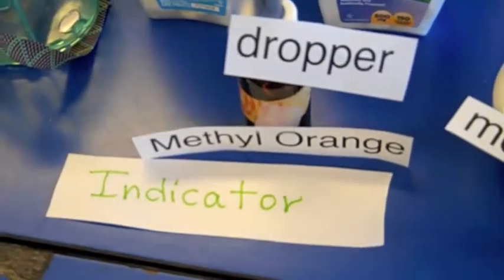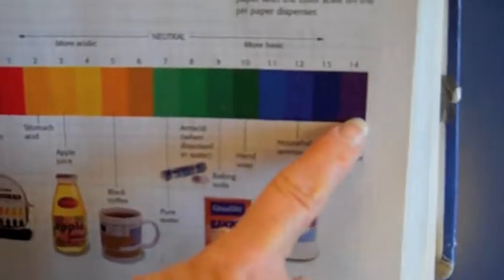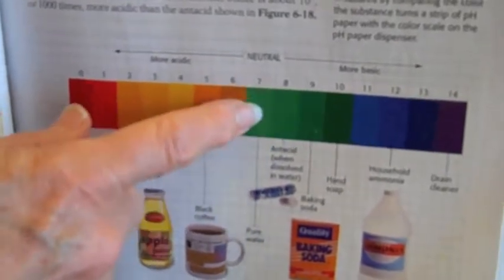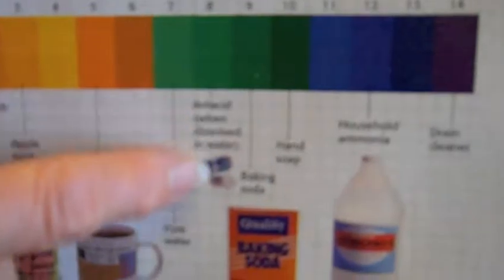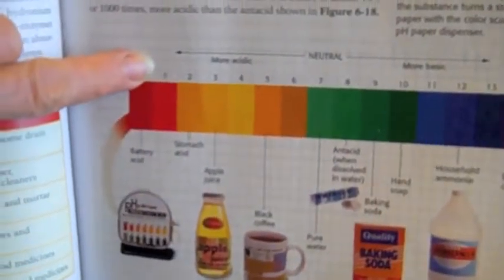So you know from your work already with the pH scale that one end of the pH scale, the lower end, is acidic. The other end is basic. The middle is neutral. That's where water is. Just one level above water is where an antacid tablet, when it's dissolved in water, lies. And hydrochloric acid is fairly strong and more down towards this end.